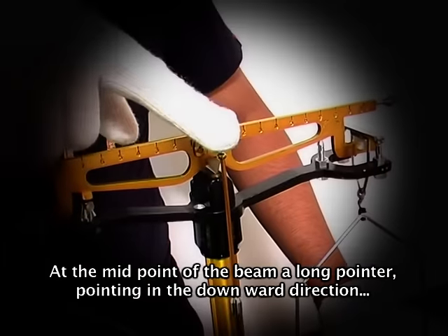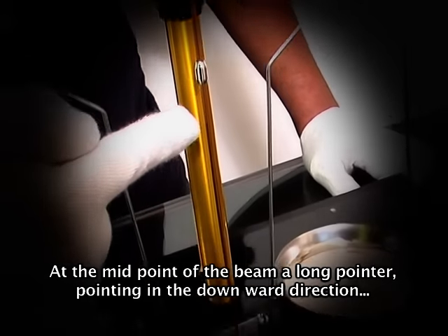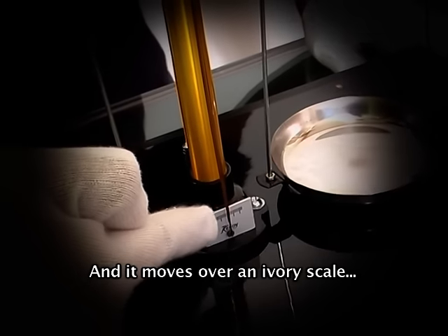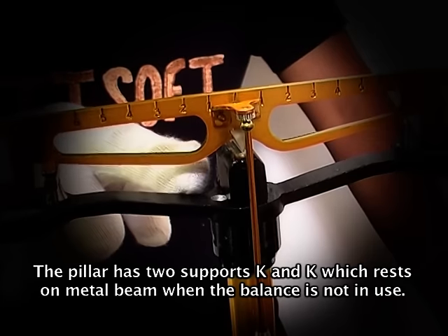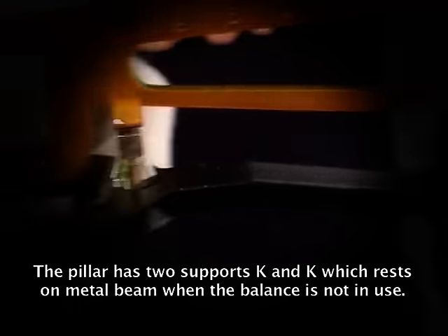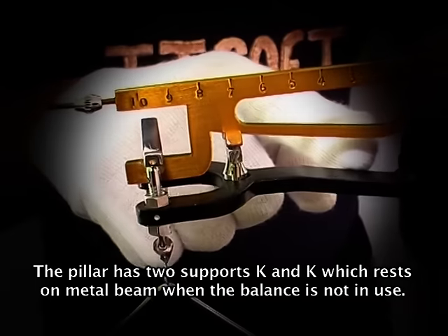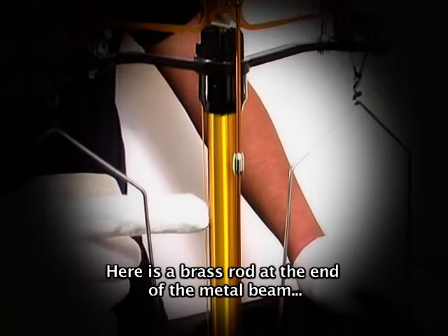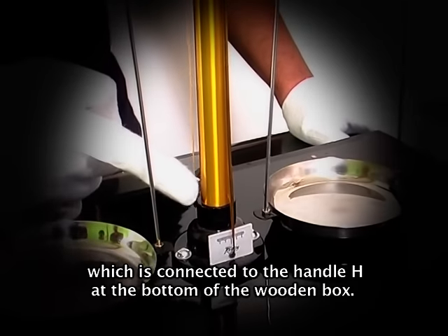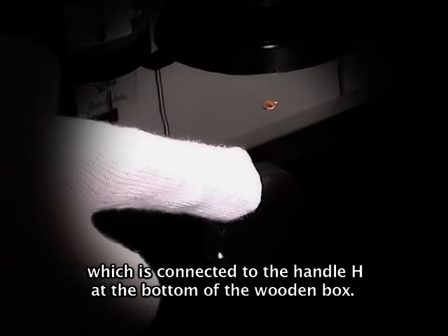At the midpoint of the beam, a long pointer points in the downward direction and it moves over an ivory scale. The pillar has two supports K and K which rest on the metal beam when the balance is not in use. There is a brass rod at the end of the metal beam which is connected to the handle at the bottom of the wooden box.